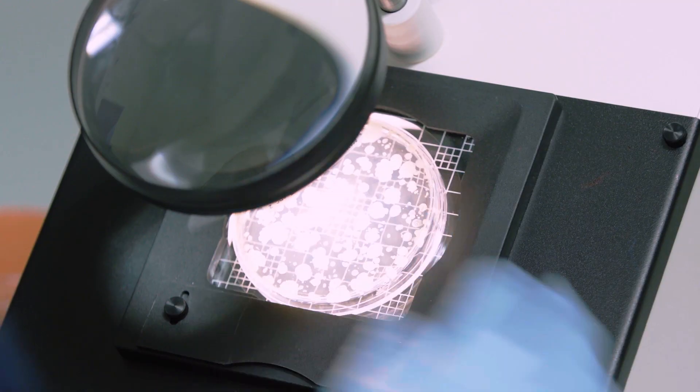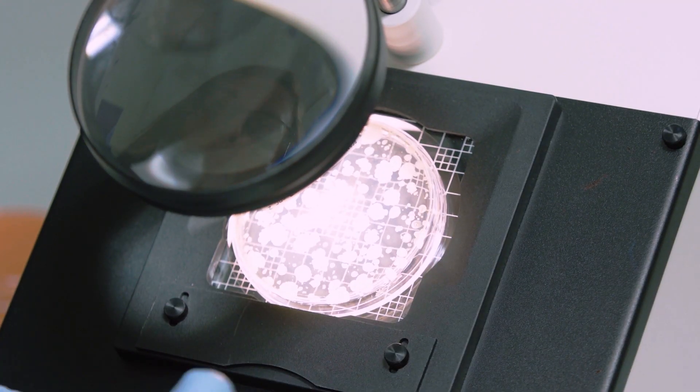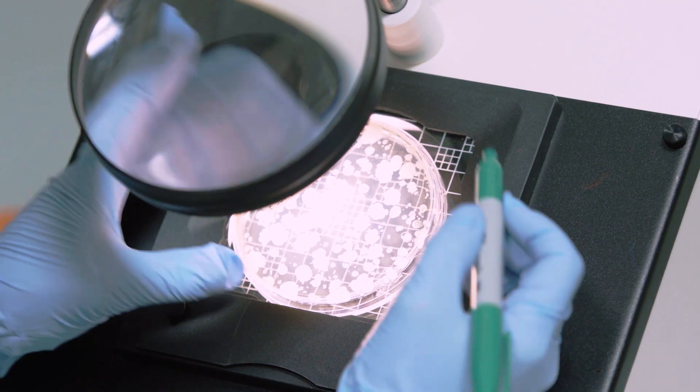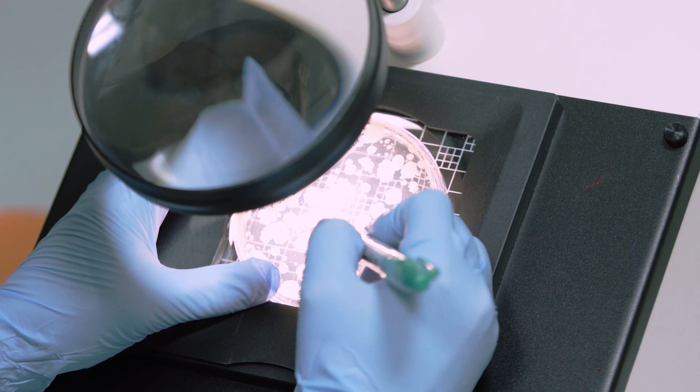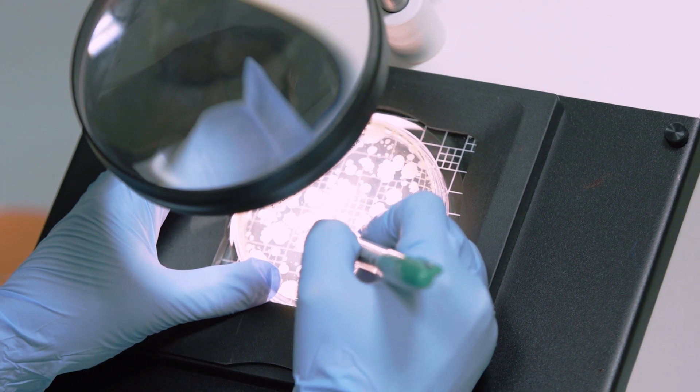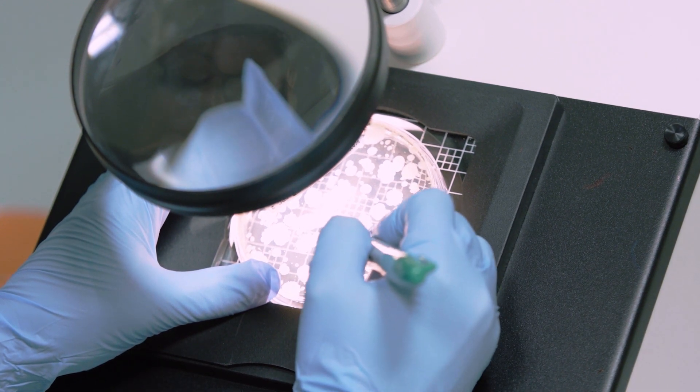At Eurofins, we've had many opportunities to guide our clients as they begin and maintain their environmental monitoring programs. Along the way, we've identified a few items to consider while collecting environmental samples.